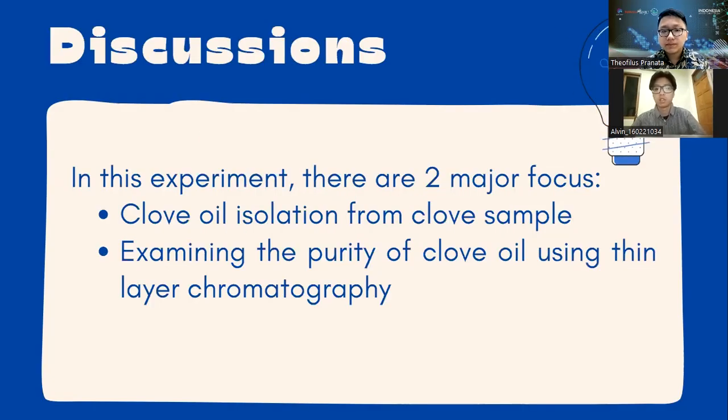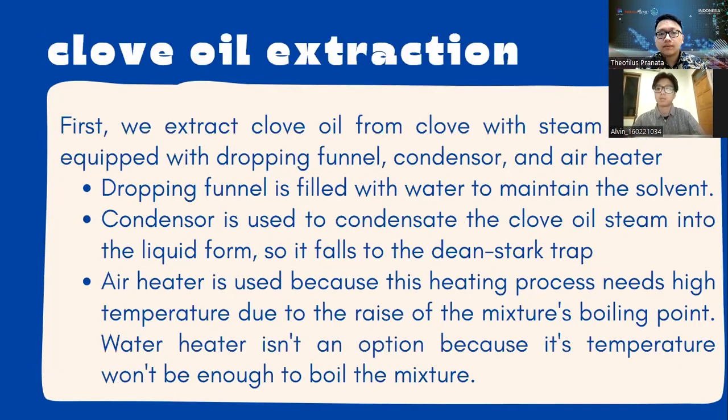And then we move to the discussion. In this experiment, there are two major focus. The first is clove oil isolation from clove sample and examining the purity of clove oil using TLC or thin layer chromatography.